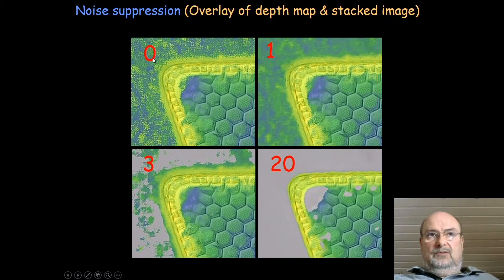The first is the noise suppression. We have it at 0. What we see here is the overlay of the depth map which goes from blue over green to yellow. Blue is in the back, green in the middle, yellow is on top. It's overlaying with the stacked image and you can see what you have at different positions. It's very helpful to judge your result.